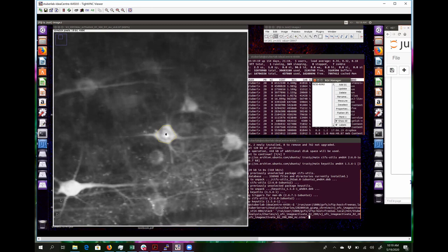So if the left corner here, imagine that as a 0 coordinate, and this has a specific location in XY. But relative to those specific locations, your imaging field could just move around. And so when that moves around, imagine what happens now.